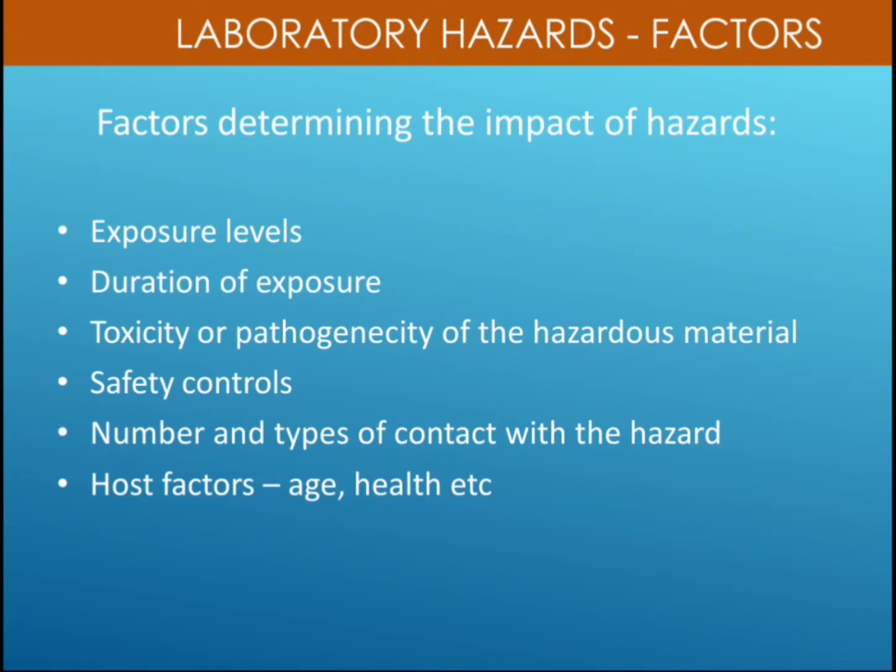First is the exposure level, second is the duration of exposure, and next is the toxicity or pathogenicity of the hazardous material. Fourth is the safety controls, fifth is the number and types of contact with the hazard, and sixth is the host factors, such as age, health, etc.